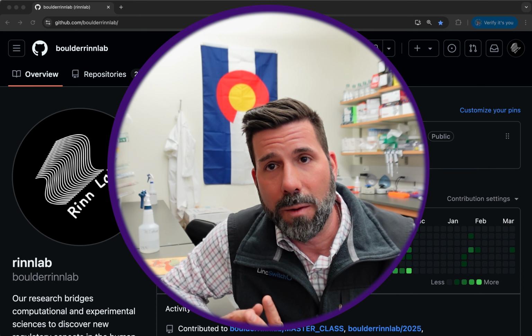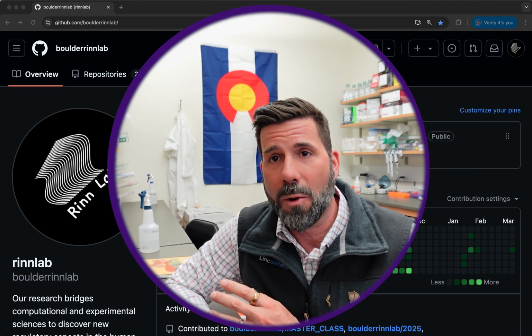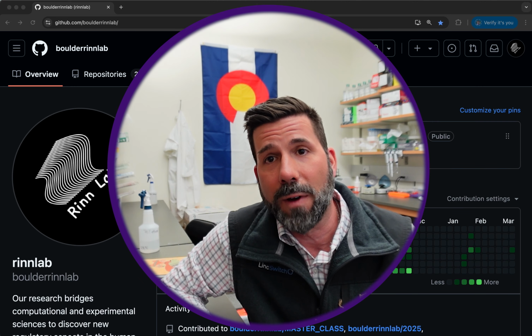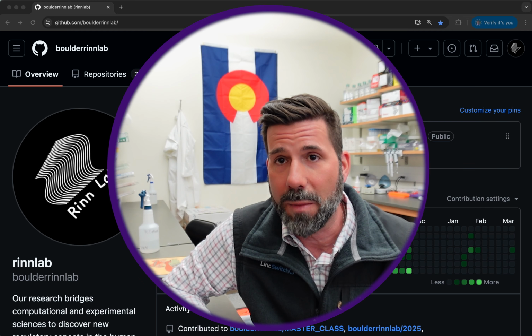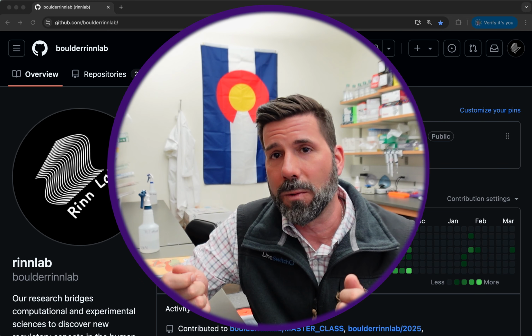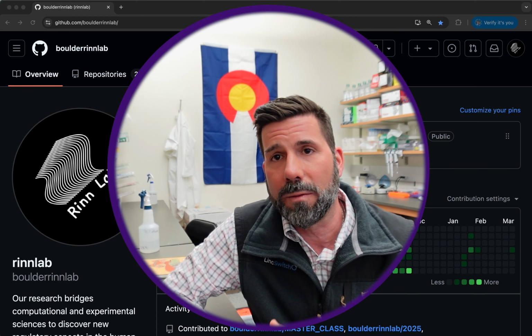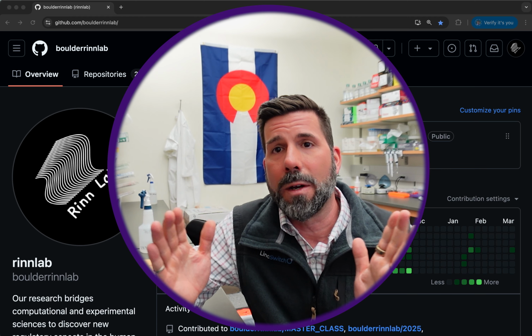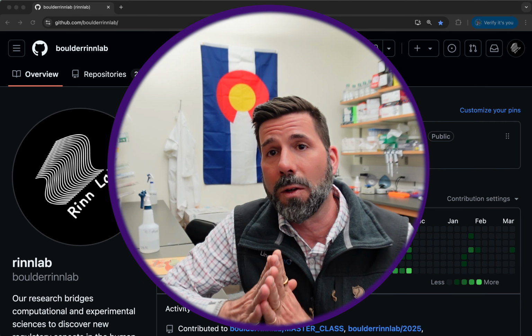So we made a function last time to import peaks, and this time we are going to make a function to find overlaps between the peak files. At the end of this, our goal will be to take the 12 files we have from different time points of dox exposure and find peaks that are in common in all of those 12 files. So that could be pretty handy.